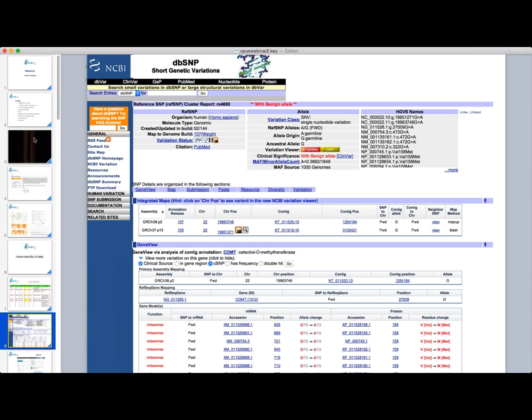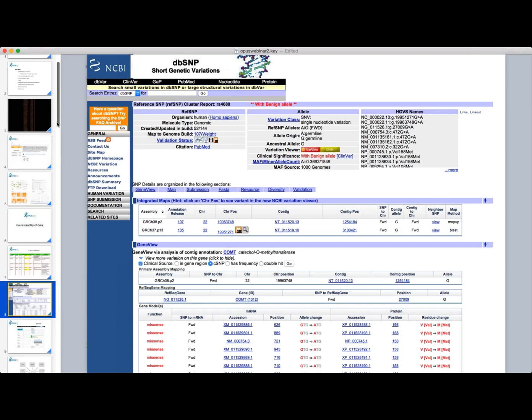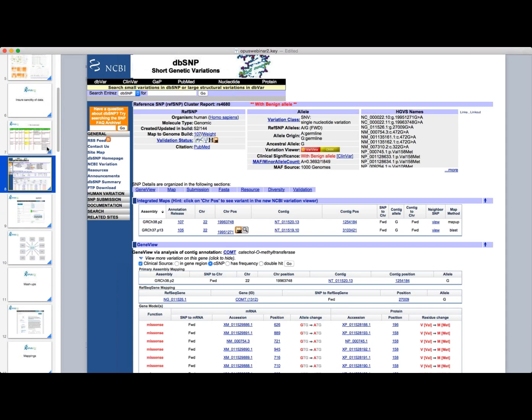So sometimes with the tabular data, they'll send the person to SNPedia, and they'll have to fend for themselves to make sense of this. And of course, SNPedia has issues with strand orientation too, because they might report a clinical study that shows one particular nucleotide, and then you look up on the top and it says DB orientation is negative, but they give you a result that says positive.